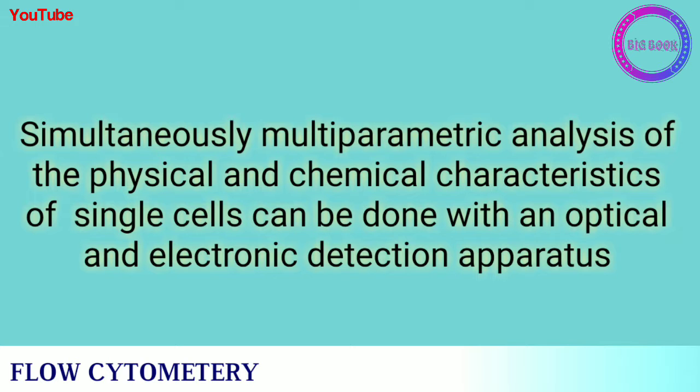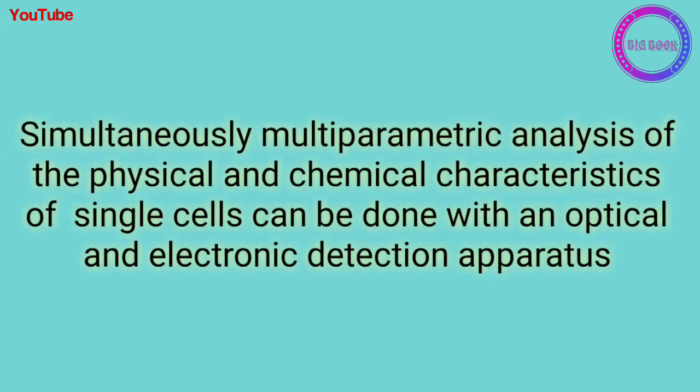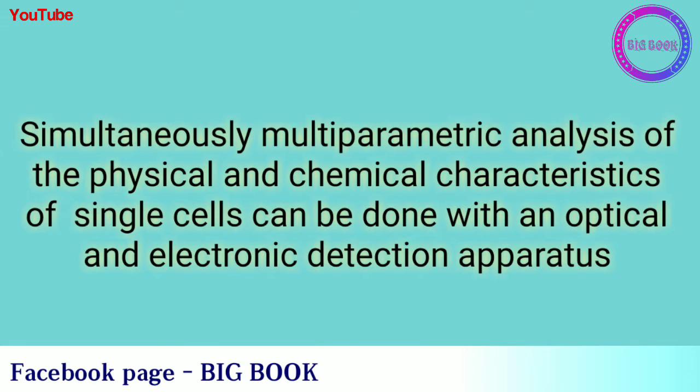Hence we can find the multiparametric analysis of the physical and chemical characteristics of single cells with an optical and electronic detection apparatus.